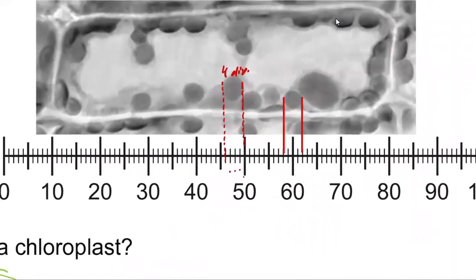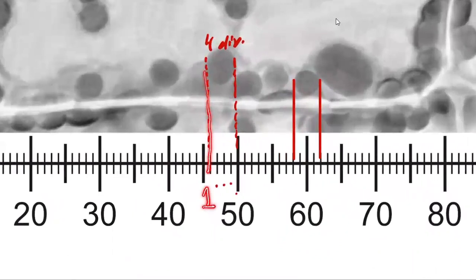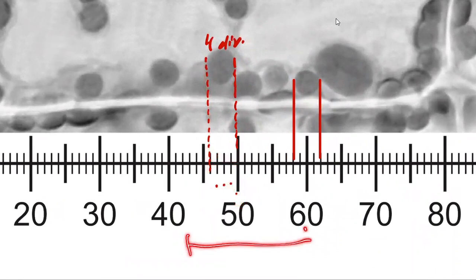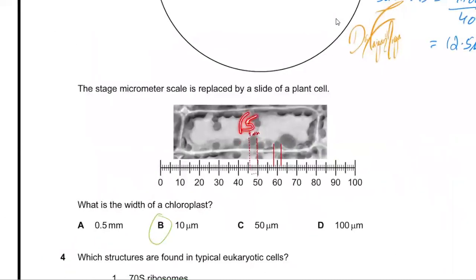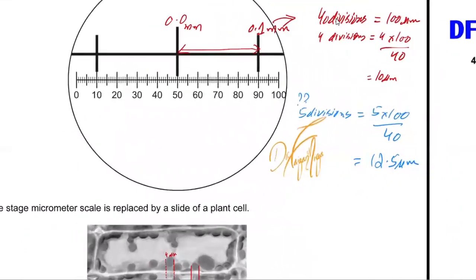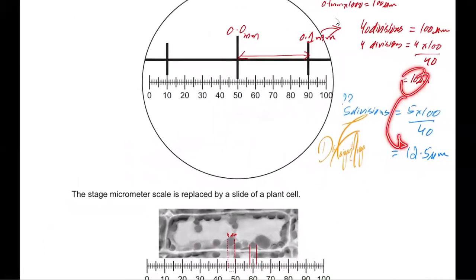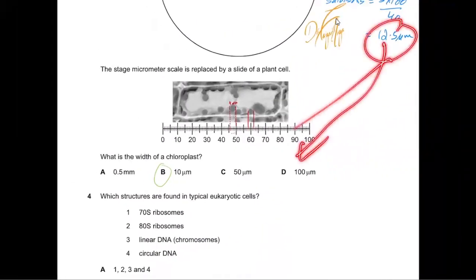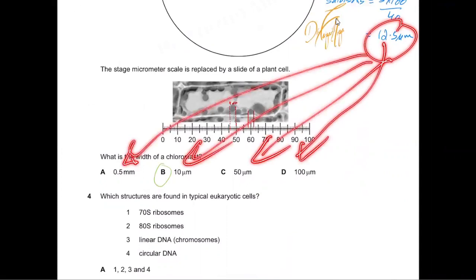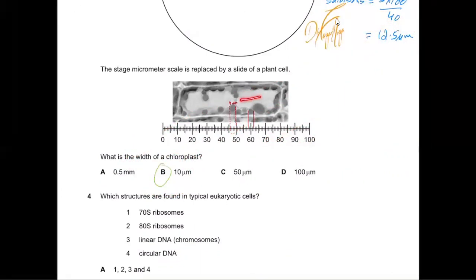A common error students make is counting four divisions as five. This happens because students treat the first line as one rather than zero. Remember that whenever we use a scale, the first value is always zero — we never start a scale with one. Even if you counted five divisions, applying the ratio gives 12.5 micrometers, which is still closest to the correct answer among the options. But the correct method gives exactly 10 micrometers.